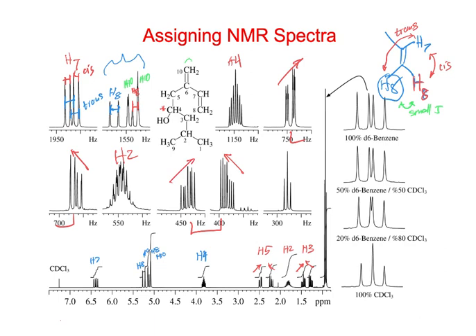Both of those would essentially be a doublet of doublet of doublets, because we have 2 doublet of doublets, and they're kind of overlapped in the middle like this. Same with this other one, but maybe you can see, I can see it here, that in the middle they're not quite superimposed. These are kind of superimposed right in the middle one.